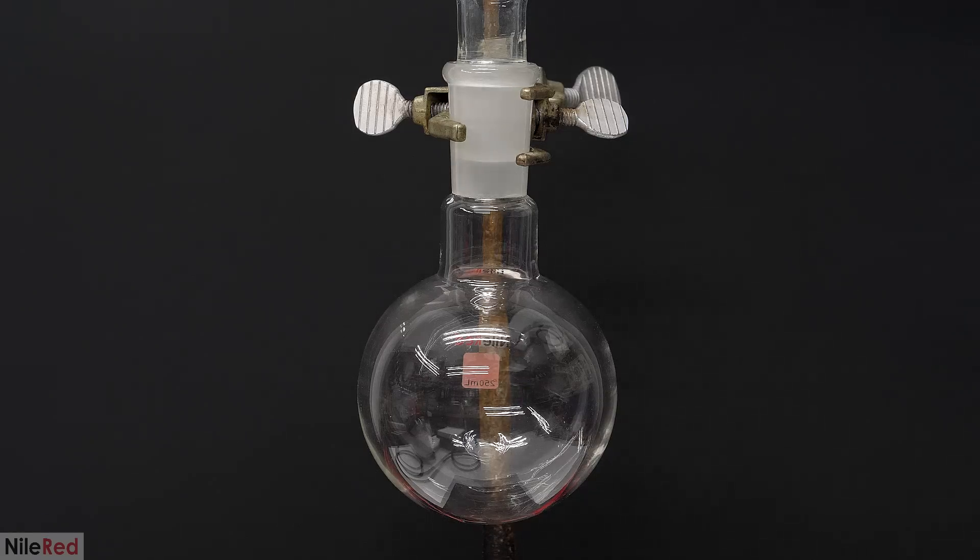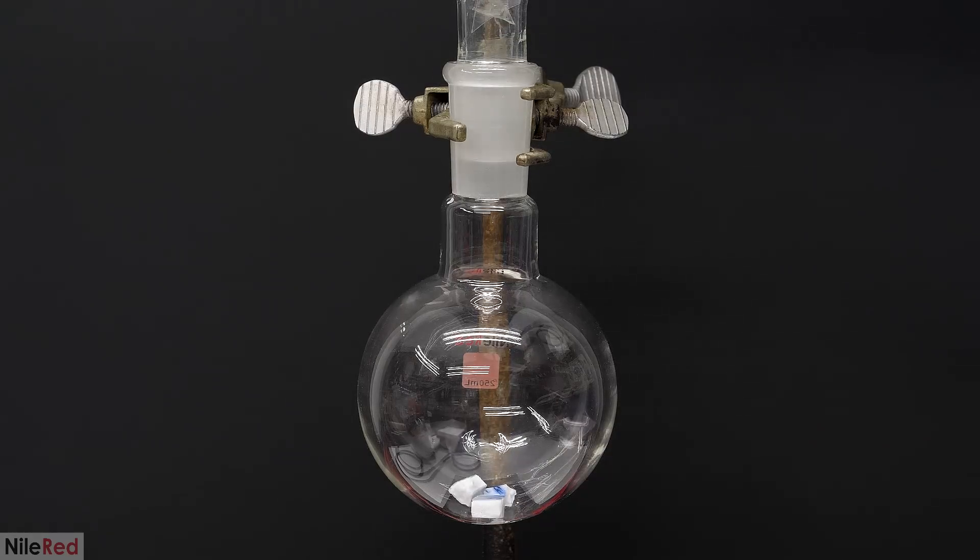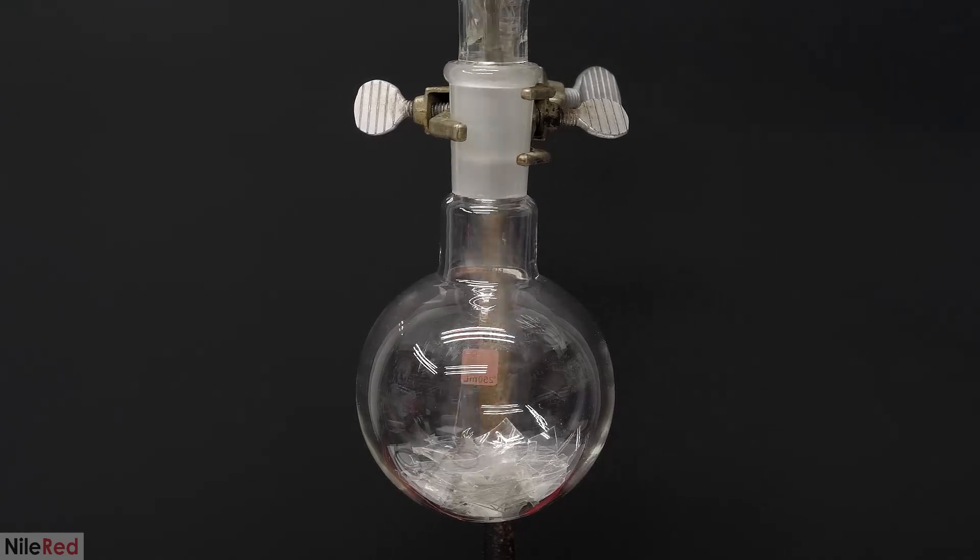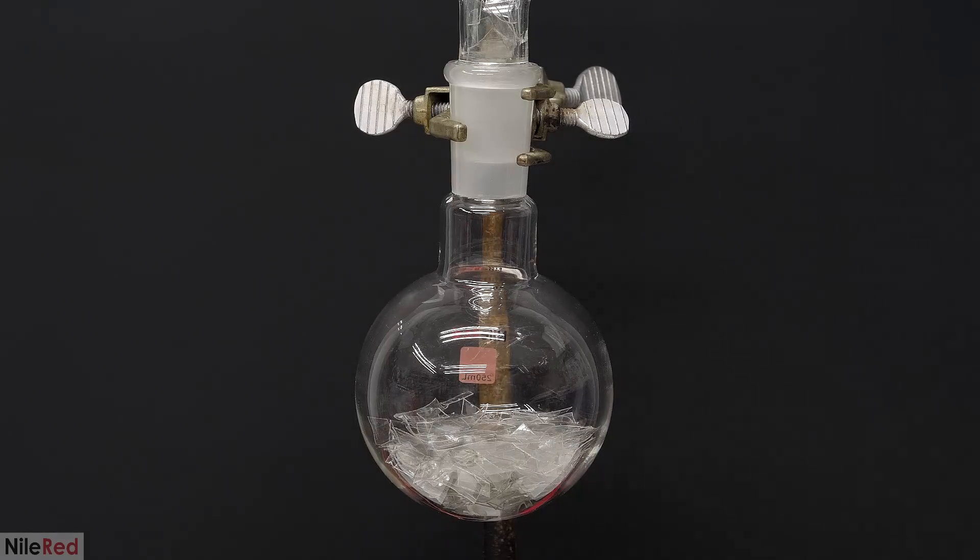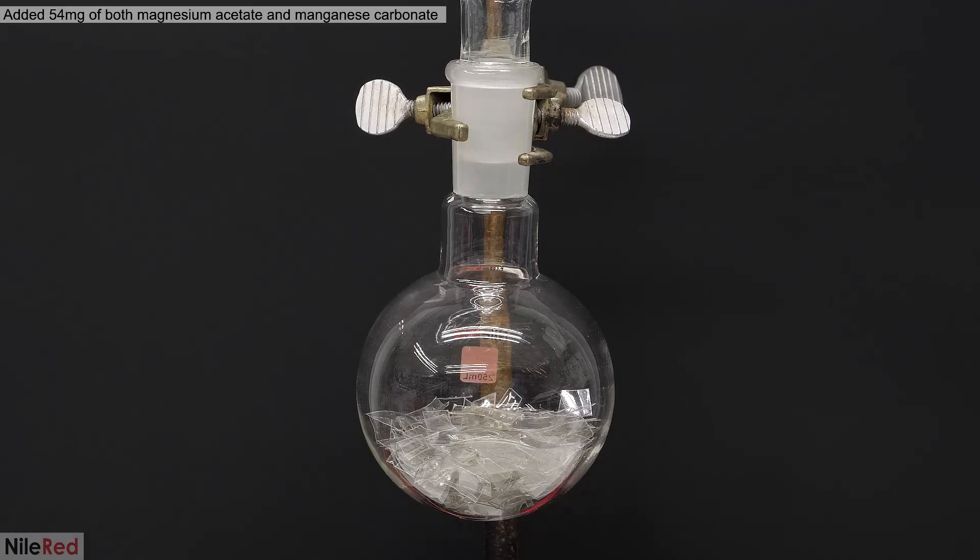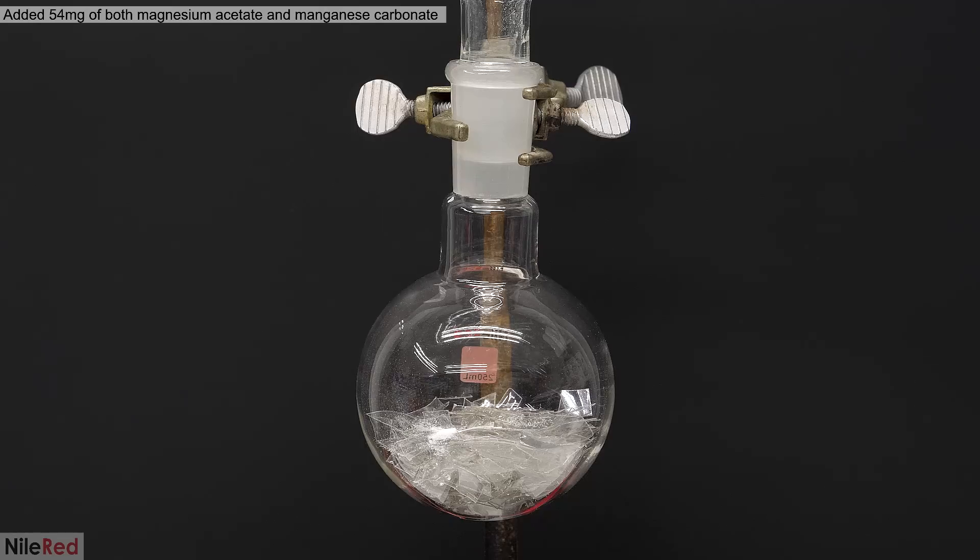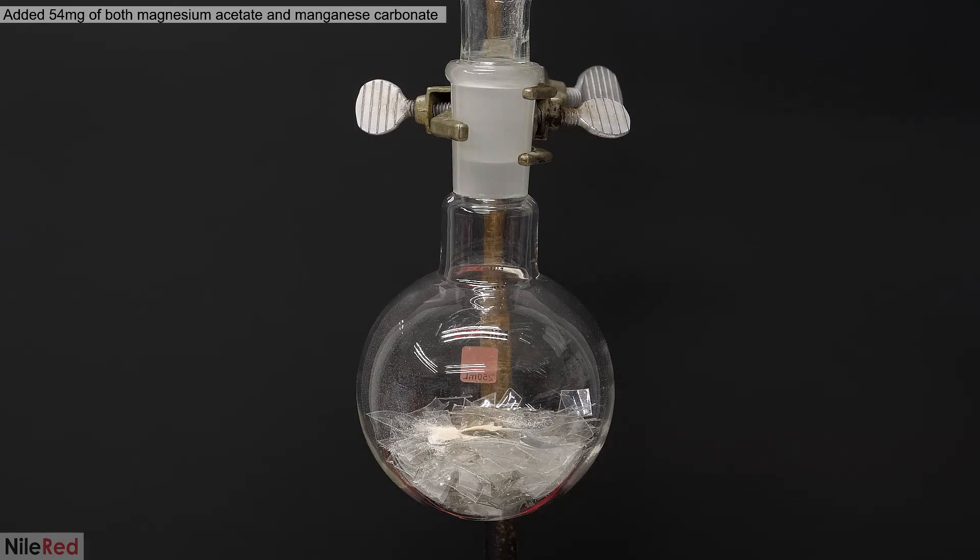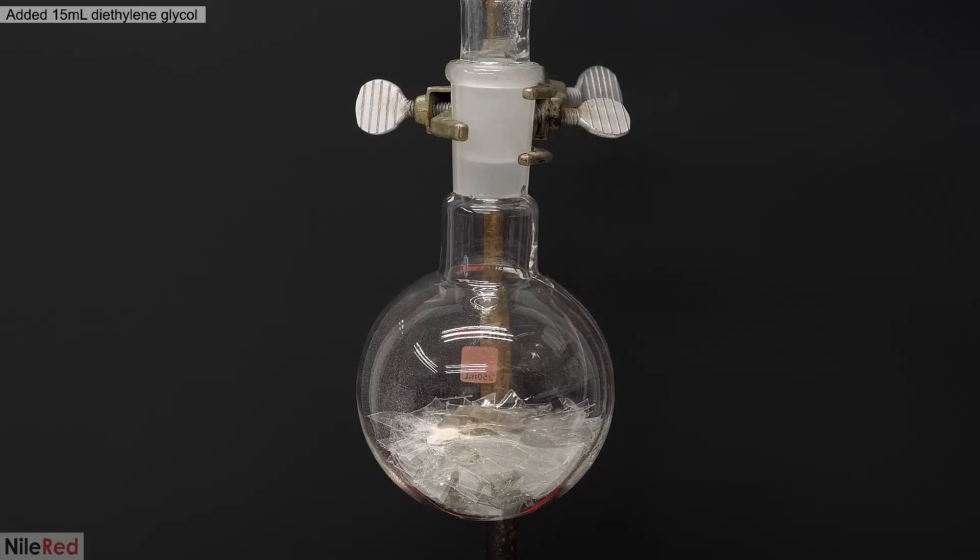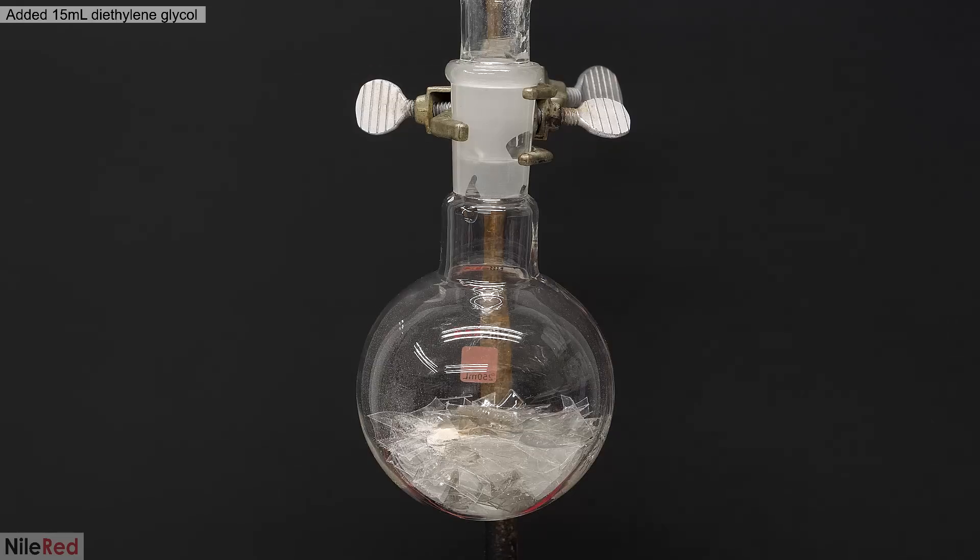Into a flask, I added some boiling chips that I got by smashing a porcelain plate. Then I added all the plastic, which actually ended up kind of being a pain, because the pieces kept getting stuck in the neck. This was totally my fault though, and it was just because I didn't cut them up small enough. In any case, when it was eventually all inside, I added magnesium acetate and manganese carbonate, which were the catalysts for the reaction. Then on top of all of this, I poured in 15 milliliters of diethylene glycol.